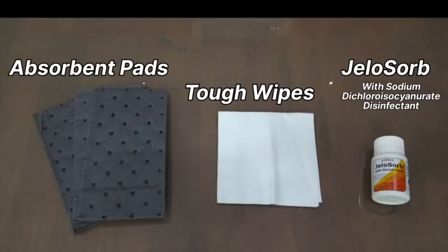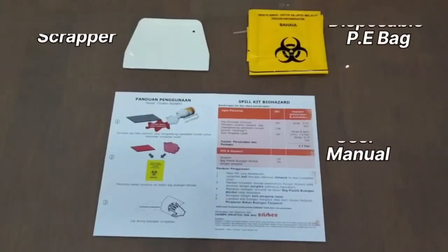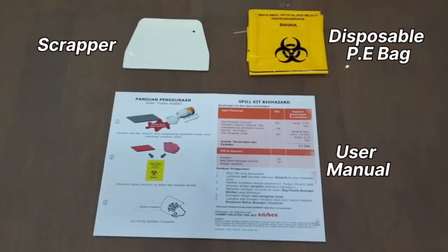Inside this kit, there are high capacity absorbent pads, tough wipes, a bottle of Gelisorb with disinfectant, a scrapper, a disposable PE bag, and a user manual.